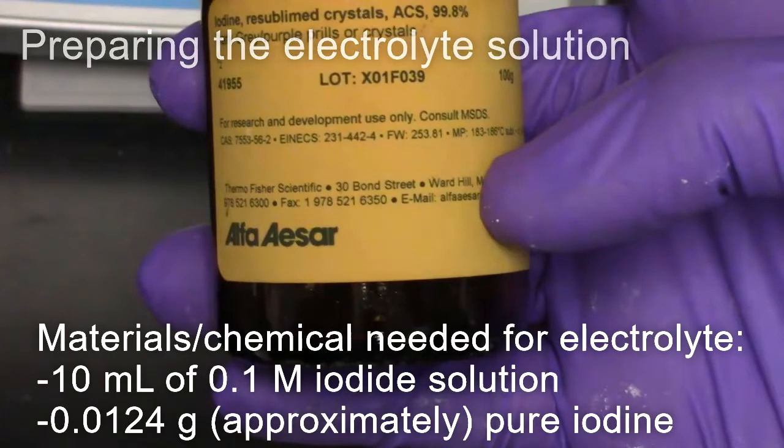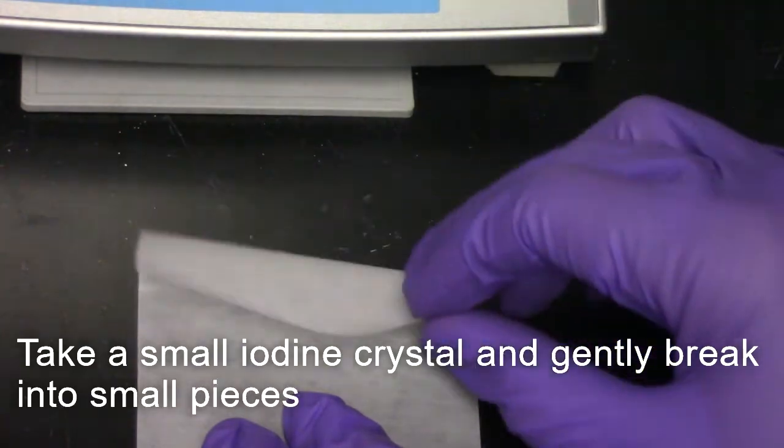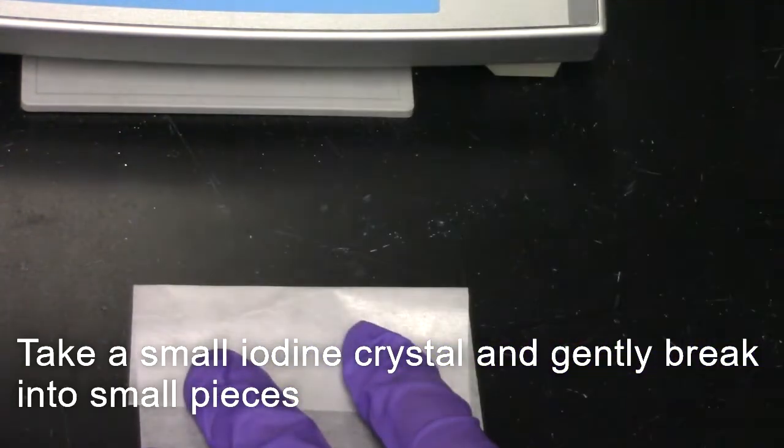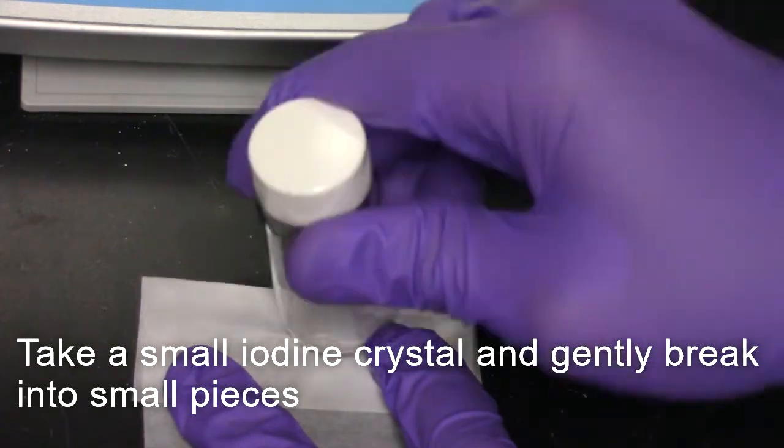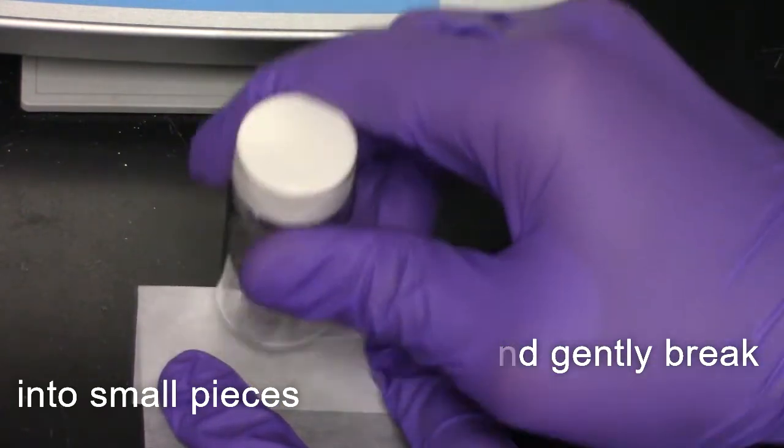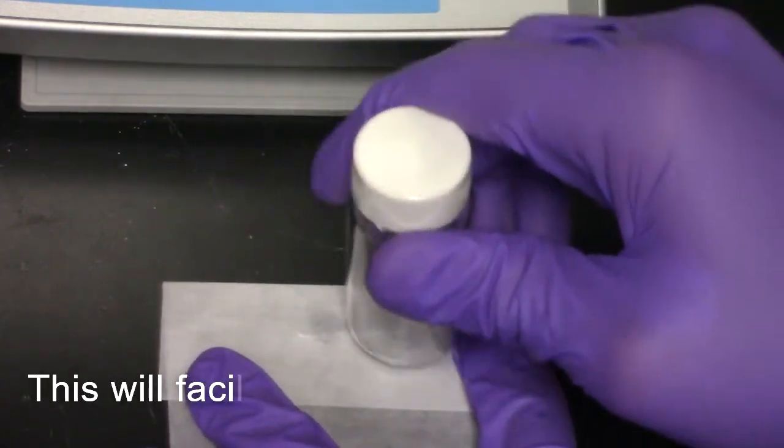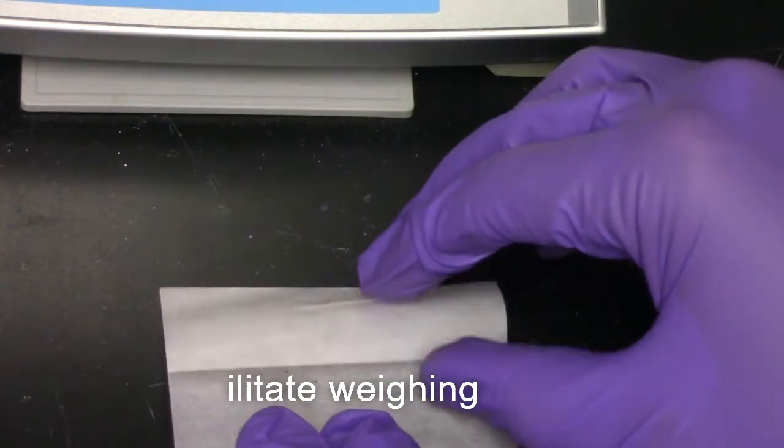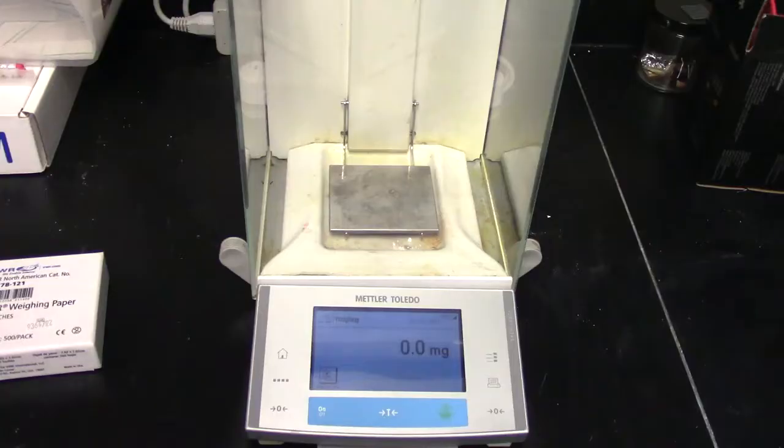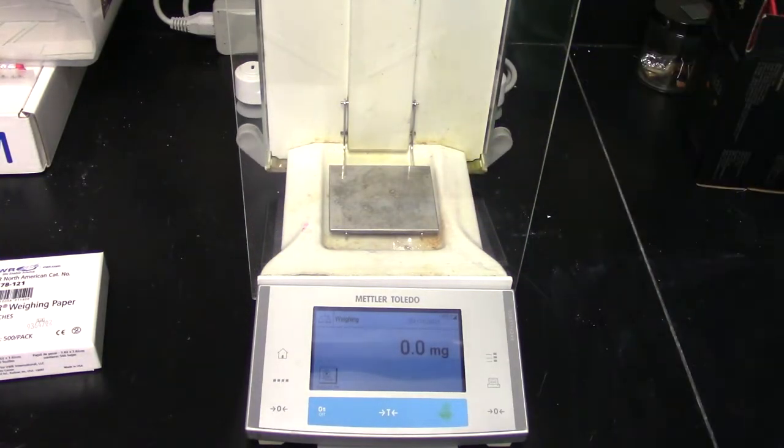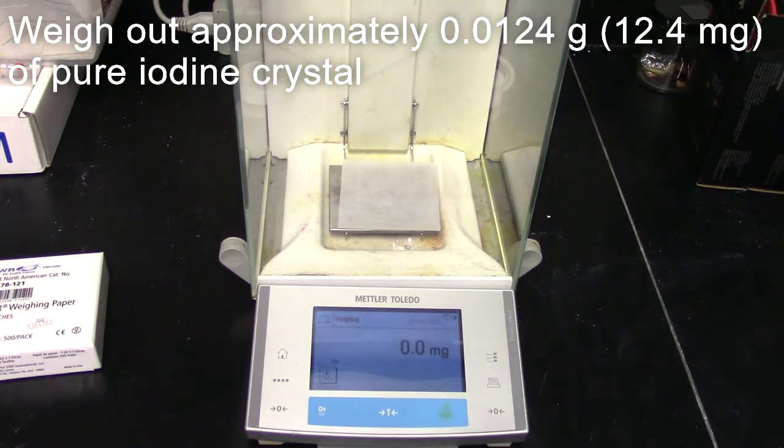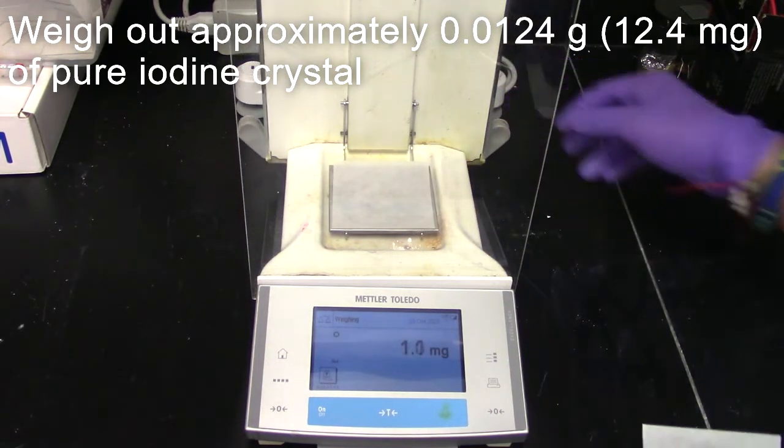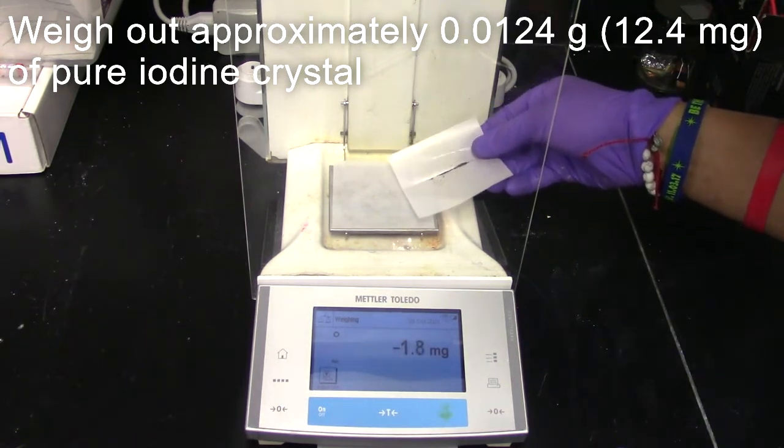Next step is to prepare the electrolyte solution. To begin, take a small amount of iodine crystal and gently break into smaller pieces. This will facilitate the weighing process. Carefully weigh out 0.0124 grams of the pure iodine crystal or approximately 12.4 milligrams.